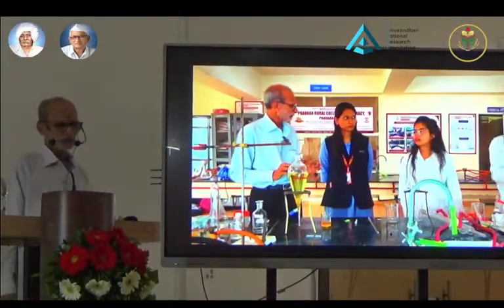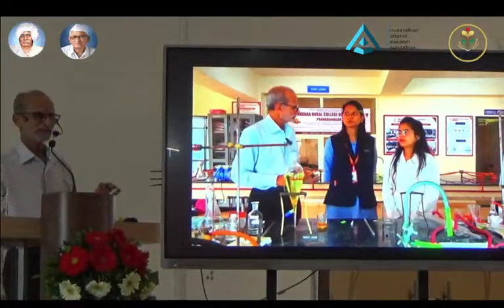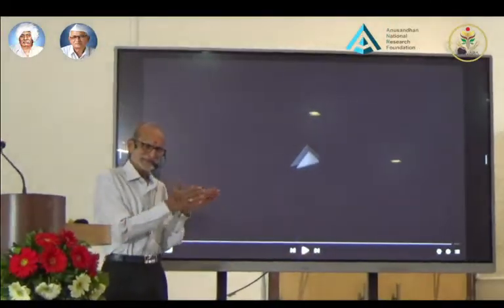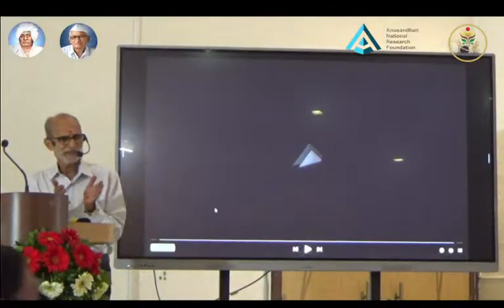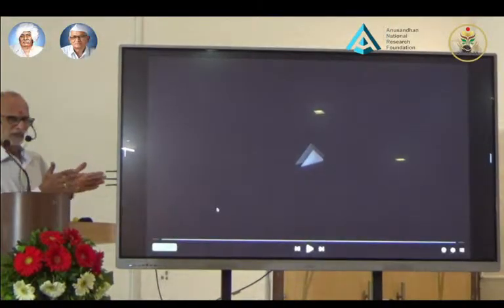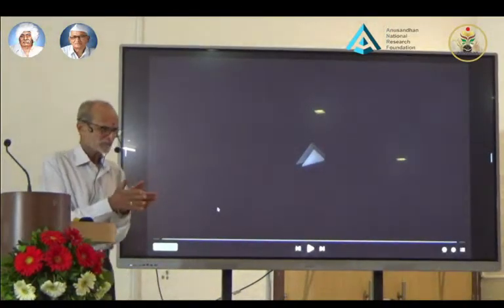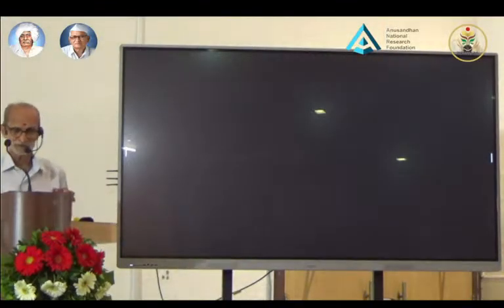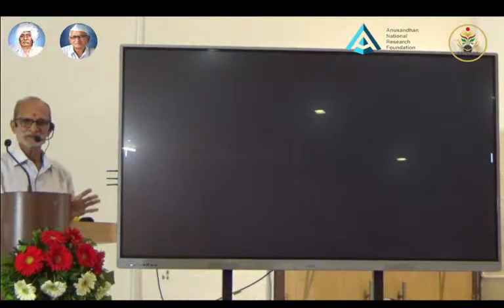Now this will be precipitated by adding sodium hydroxide. But precipitation will be undertaken only in the acidic range because quinine sulfate has less solubility around pH 6 to 7. So we are going to add sodium hydroxide solution drop-wise till we get a persistent precipitate.